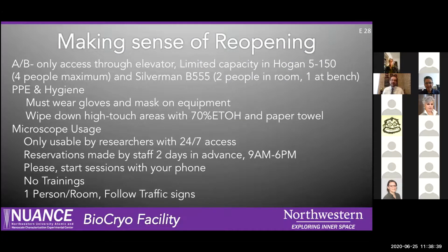We've got paper towel in there, spray it with some 70% ethanol. Make sure you wipe down all the high touch areas. So don't forget, if you're using the TEM holder, just the handle of it, not the rod. Doorknobs, light switches. We have the keyboards and mice wrapped with saran wrap. We are periodically changing that out, but you can also wipe that down as well. That will keep it safer in case we're not able to get in there right away to change it after your session for the next user.